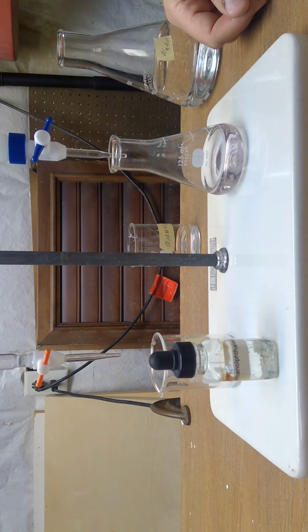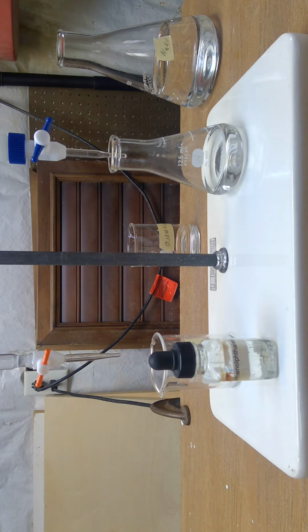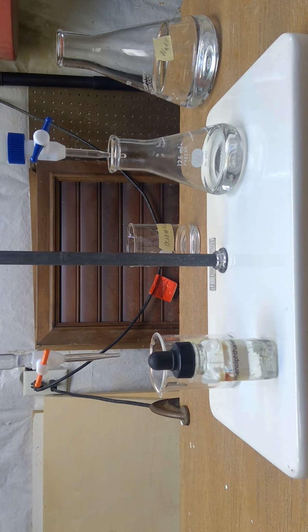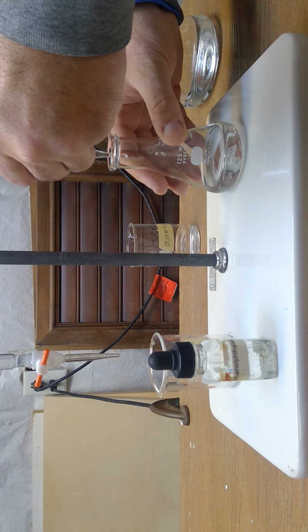Ooh, and that's a really light color pink. I'm not sure if you can see it. Kind of faded, but I'm going to take a reading there. And this is about 40.7. 40.7. And maybe 40.69. Okay, let's add another drop though, just to see what happens.